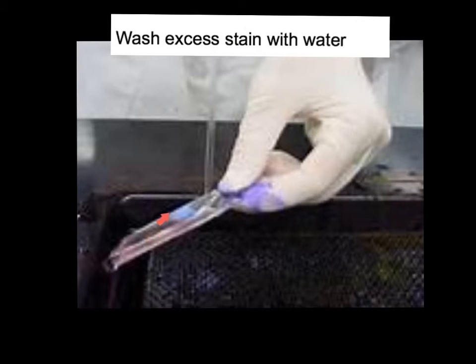Now note that we are holding this at an angle and that our bacteria smear is right in this area, and that we wash with the water hitting above the bacteria smear. This way we will not wash the smear off, and as the water drains down it will wash the excess stain off while the smear stays intact. We will then blot dry our slide before we add our next stain.